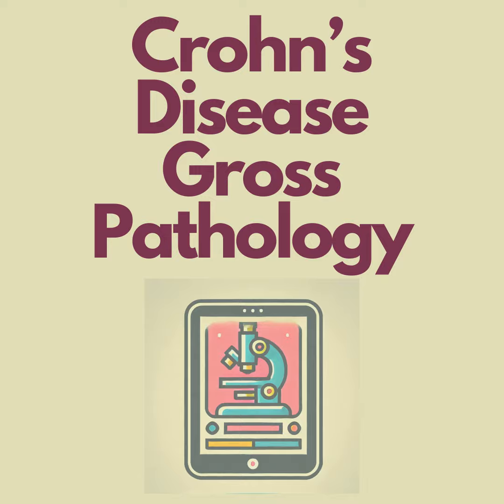Interesting. And is that something that we see in both Crohn's and ulcerative colitis, or is that more specific to one? Well, we can see pseudopolyps in both, but it's much more common, I would say, in ulcerative colitis. But it's definitely something that you can see in both. Okay. So we've got these pseudopolyps that are present in our specimen. Let's start working our way from proximal to distal on this colectomy and describe what we're seeing.